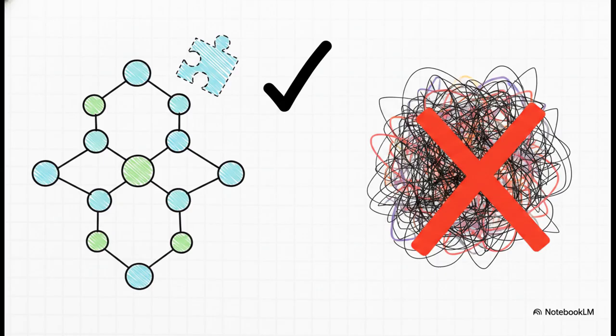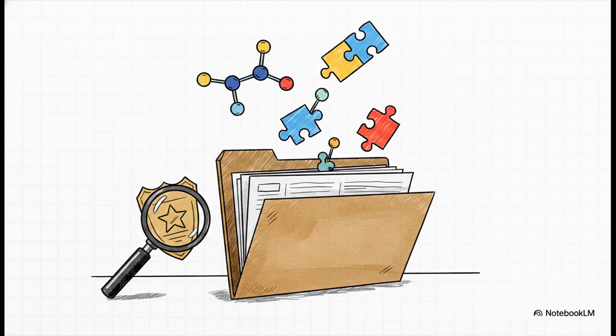It has to be logical. Let's move into part three, rules of the weight game. The microscopic world is absolutely full of decoys, so we need a few detective cheat codes to verify we have the right suspect. We can't just rely on finding the highest number. We have to use the fundamental laws of chemistry to cross-examine our data.